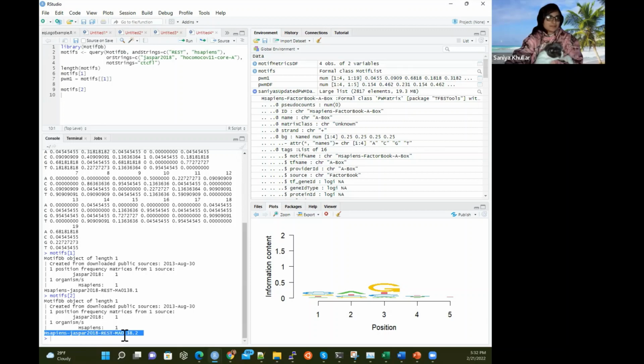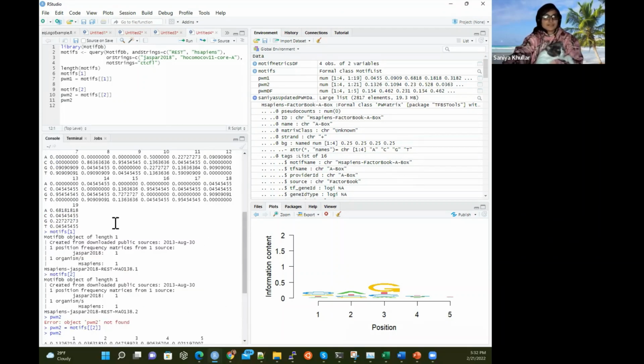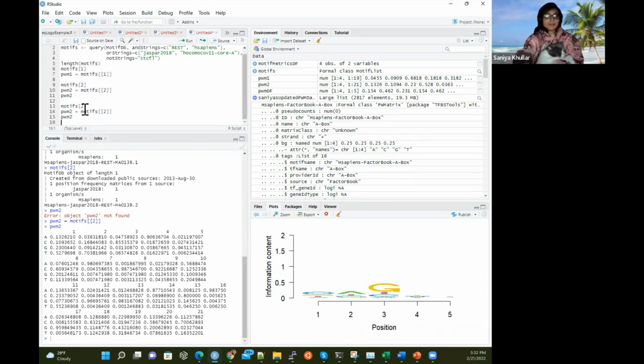This is for the second one here, corresponding to this here, motifs 2. And we can do PWM2, for instance, and then we can extract what this object is. You can see that this one, instead of being 19 bases wide, the motif is 21. You can see that in the real world, these become a little bit bigger than we expect, and the motif that it's binding to can be different. But the 16th position looks really good, a strong probability, 98.3750% chance of an A being in the 16th position. And then in the 3rd and last position, we can also see this too.